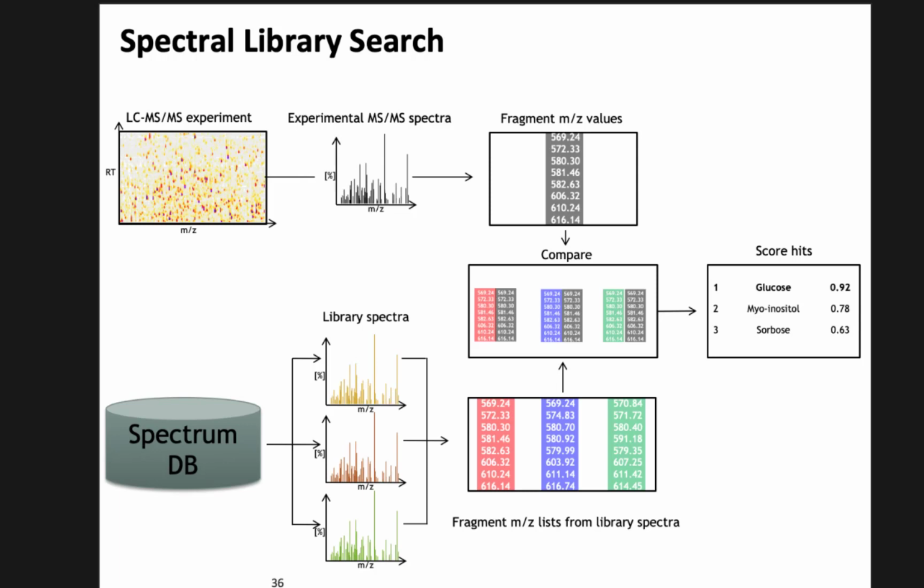Why would the mass spectra look different if they're from a different instrument? Yeah, different detectors, there might be different resolution, but there even might be different ways to collide the spectra. There might be different ways in which the ions are actually trapped and then used downstream. So you will see differences in these spectra, and they are very subtle, and oftentimes we don't really know why they're different, to be honest. We just see that the characteristics of this fragmentation will be different under these conditions.